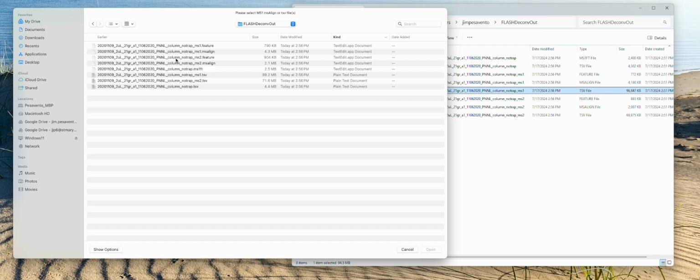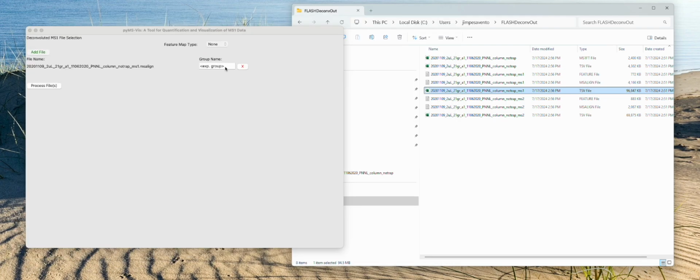All right. I'm going to add, let's see, I'll do the same analysis on both MS Align and TSV so you can kind of see the difference here. So just loading one file in, there we go.